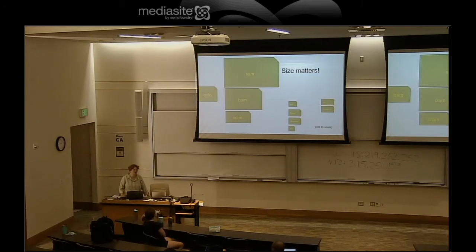And so compression is doing that kind of thing. It isn't necessarily exactly that, but the idea is trying to smush the data into a smaller space. So those are the mapped files. They are very big. And therefore, the first thing we're going to learn about is counting out of those mapped files. And that is something you will probably want to do on a supercomputer because those files are so big, you don't want to put them on your computer.